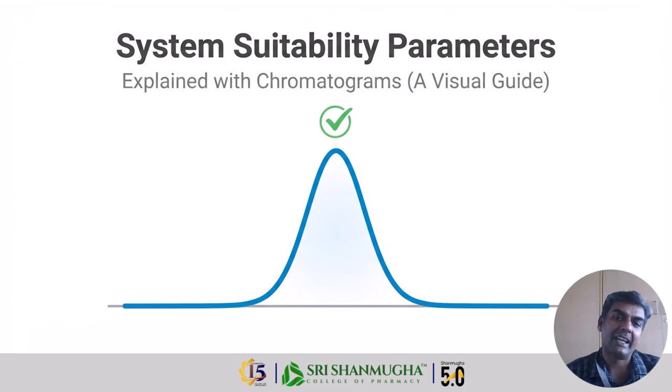Before we start any HPLC analysis, we must make sure that our system is working properly. Just like before driving a vehicle, we check the brakes, isn't it? We check the fuel and we also check the working condition of our engine before we leave using our vehicle. In the same way, we want to check the HPLC system using some parameters that is called system suitability.